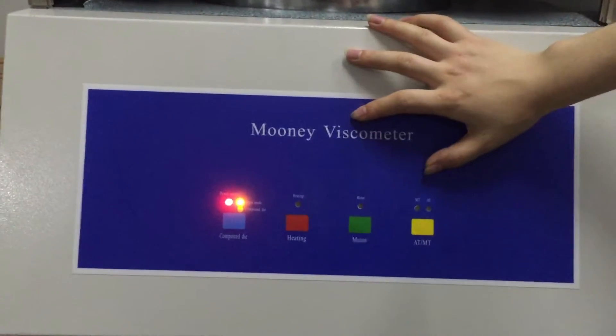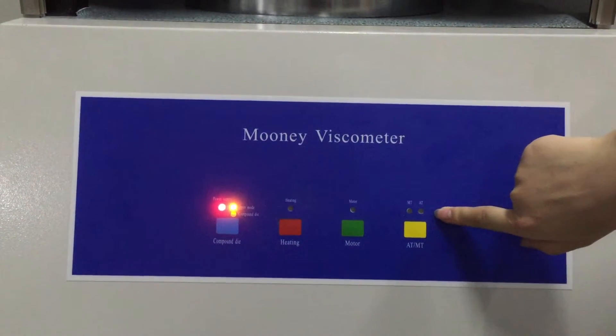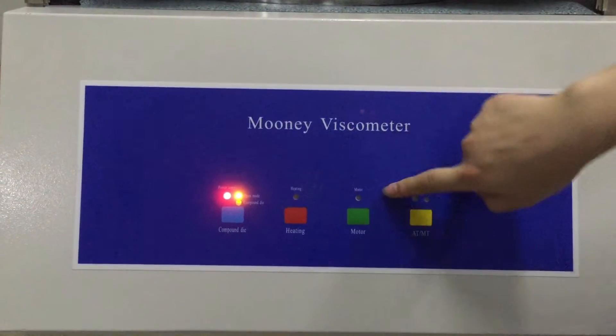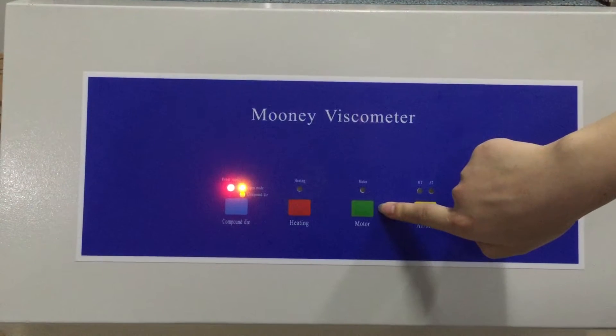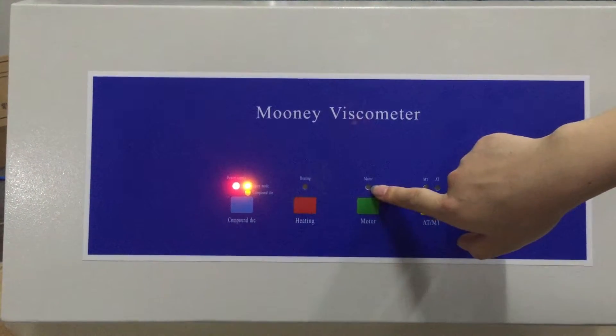On the panel, there were four switches. This is to choose from manual operation to automatic operation. This is just the display of the motor working. When the machine is working, this light will flick.